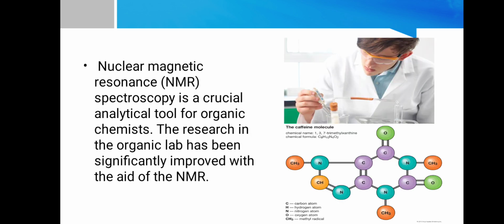Nuclear magnetic resonance spectroscopy is a crucial analytical tool for organic chemists. Research in the organic lab has been significantly improved with the aid of NMR. So it was the basics of NMR.